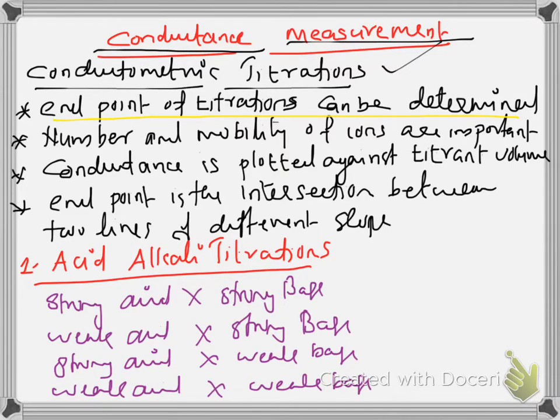Today we have to discuss conductance measurement and its application. Conductance measurement was already completed in one of the previous classes. It can be done using a conductivity cell. Today we are mainly concentrating on the applications.